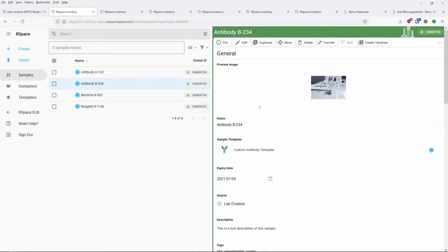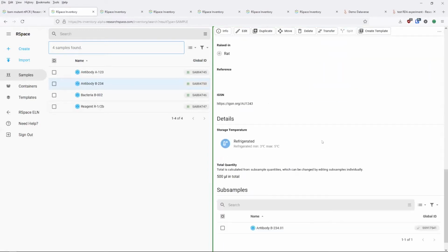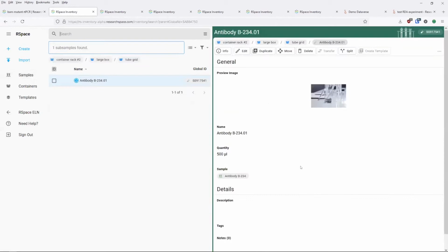So we have quite a modern, simple interface because we really want to make sure that we're showcasing all of the important information without overwhelming you with information. So we're continuously reworking the interface to be minimalistic, but still provide a lot of power. One thing is, for example, let me scroll down, let me select the subsample.